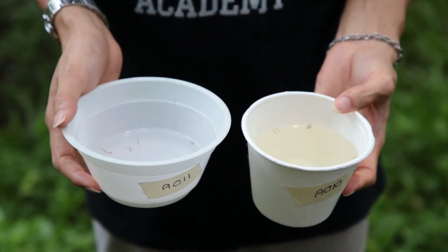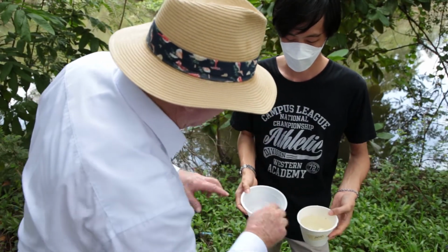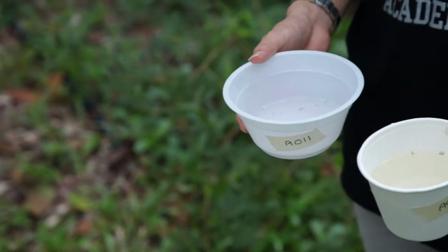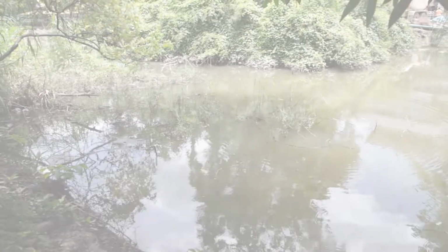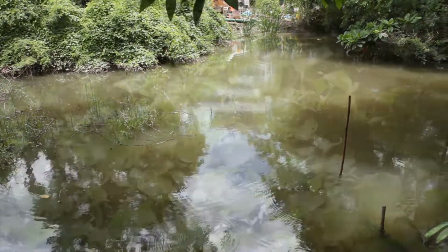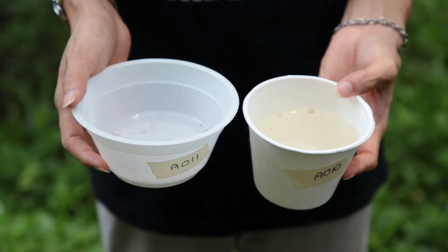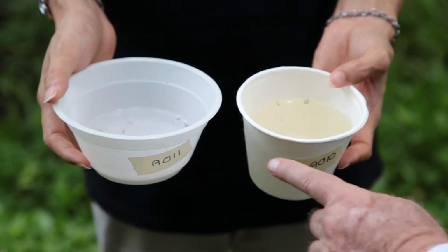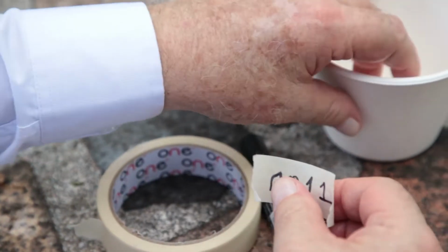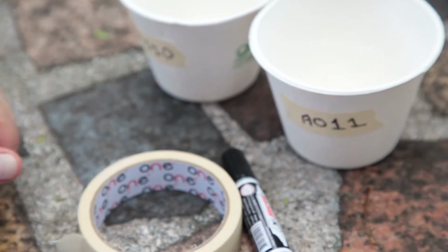Remember, always keep larval specimens collected from one sampling site separate from larvae collected from another site, so you can associate the mosquito species with a particular breeding habitat. For example, does this species prefer sunlit, clear water, or does it prefer heavily vegetated water, and so on. So each set of larvae collected from a particular breeding site must be kept in their own container and their own specific code that links them with collection data in your data spreadsheet.